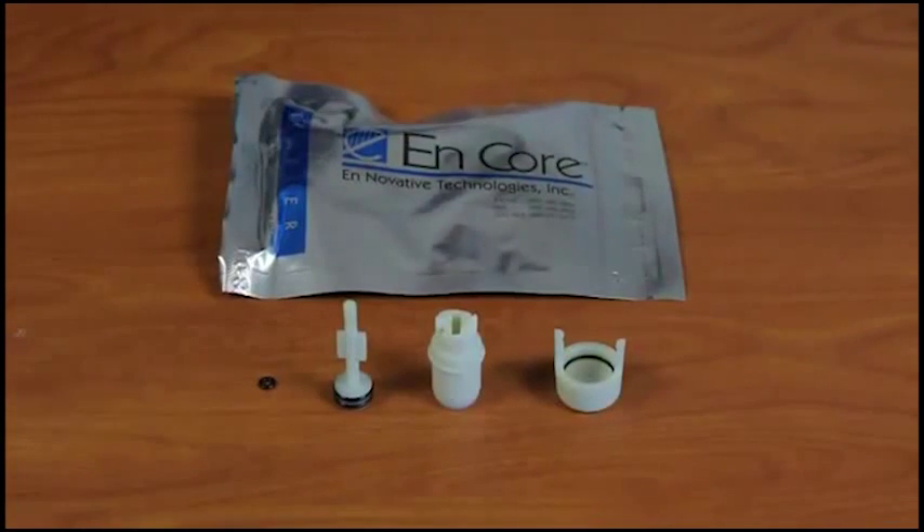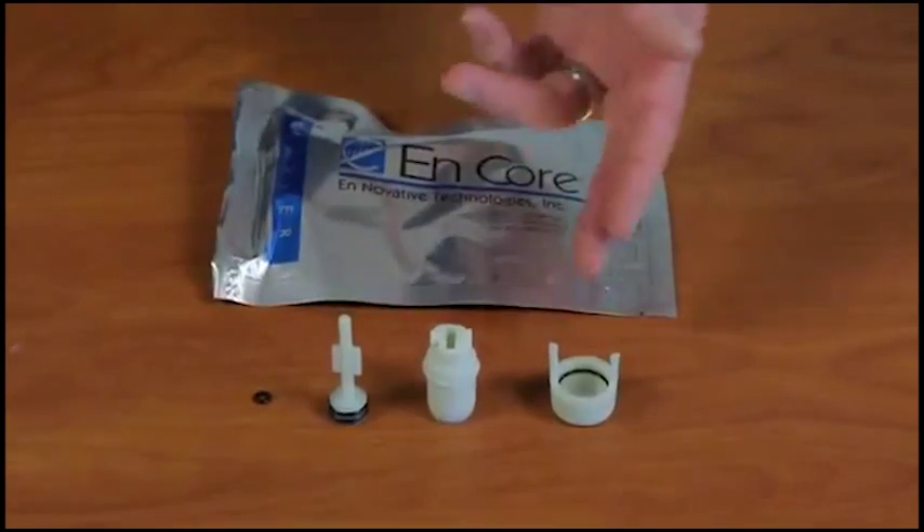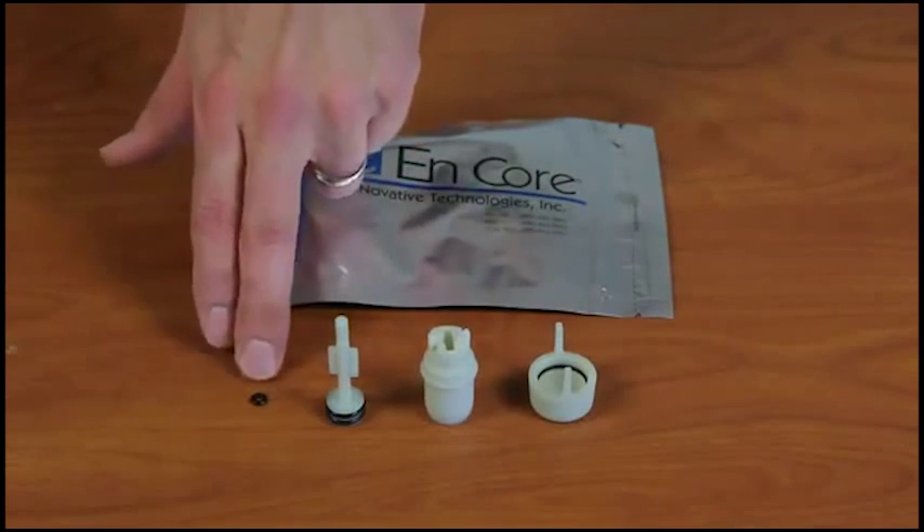This is the 5-gram Encore sampler. It arrives in this bag. These are its parts: there is a cap, a body, a plunger, and an O-ring.